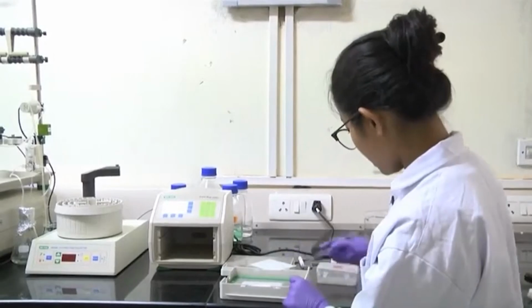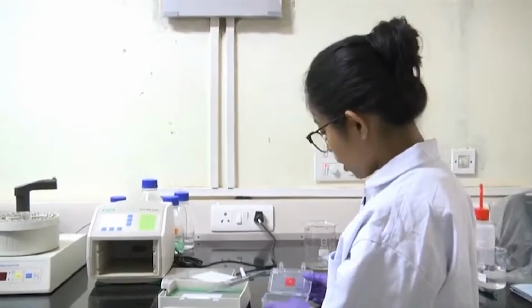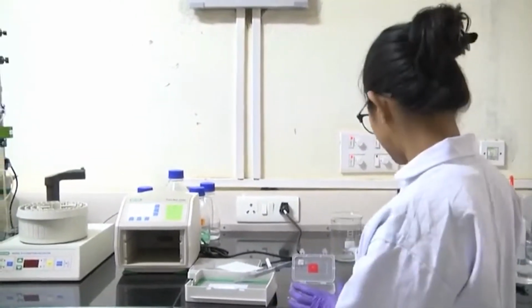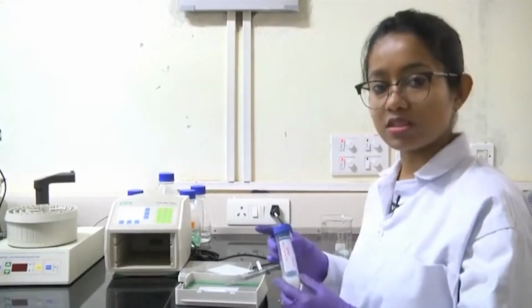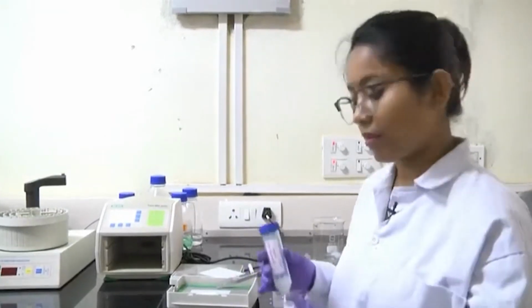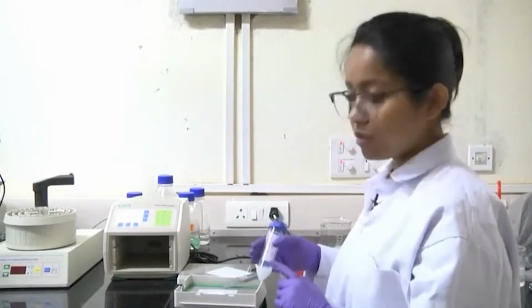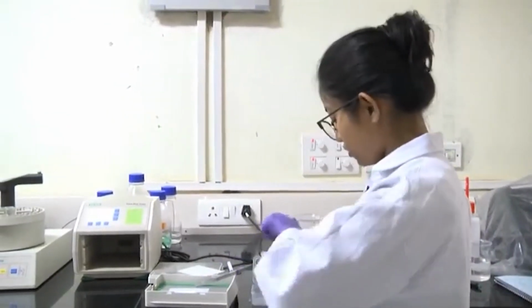Now, in a box we will take blocking solution. The most commonly used blocking solutions are skim milk or BSA. These are non-specific proteins. Here I have 5% skim milk, or fat free dry milk, which was dissolved in TBST buffer. This is the buffer later on in every wash, and the secondary antibody and the primary antibody will all be in the same buffer. So, the milk is dissolved in the buffer at 5%. If you want to use BSA, that will also be 3 to 5% in the TBST buffer. You can also use the BSA. So, here I will put the skim milk.